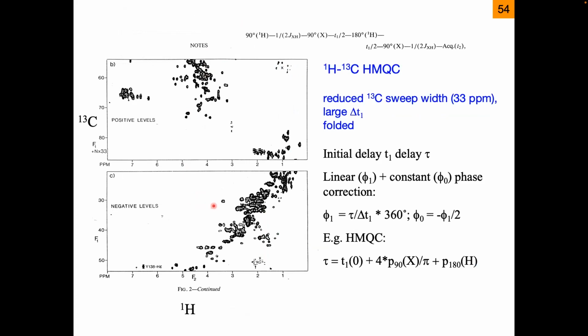And actually now you can do the folding in a way that when you fold one time, it gets negative. When you fold 2 times, it gets positive again. This is not shown in color here, but here were the negative levels and here were the positive levels.